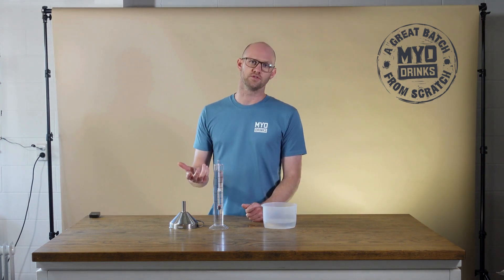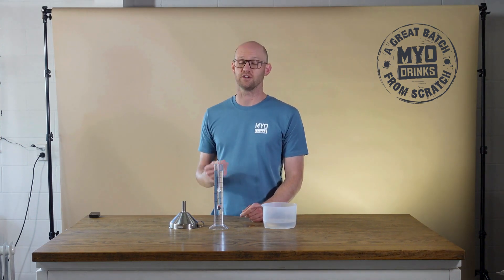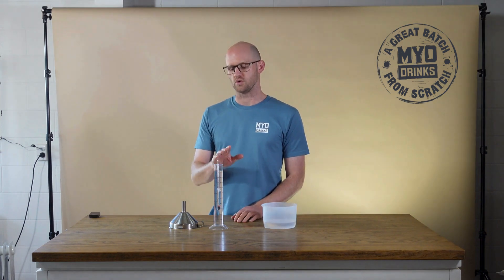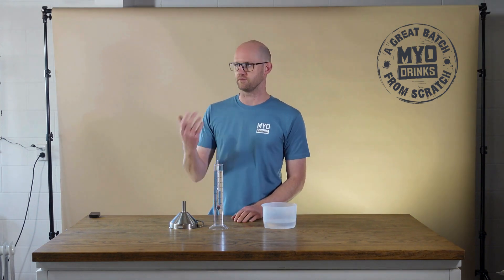Additives like flavourings and liquid glucose can also distort the reading of an alcometer. So make sure you always measure your spirit before you've put in any additives.